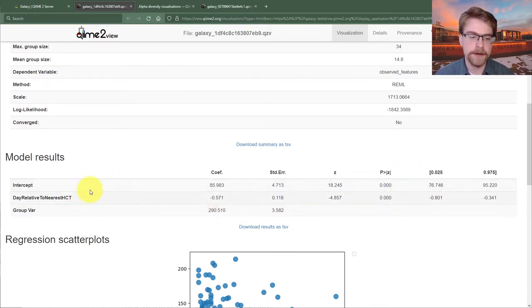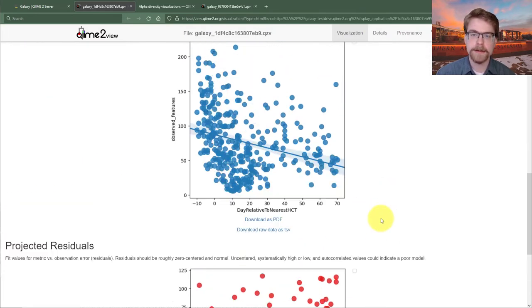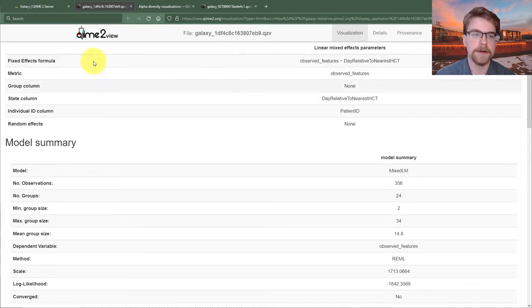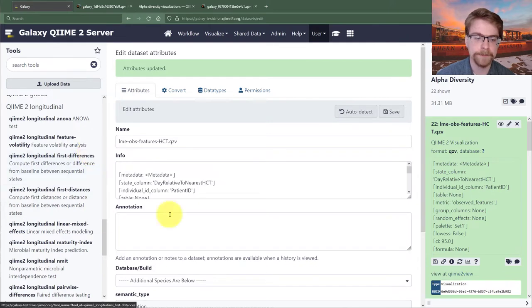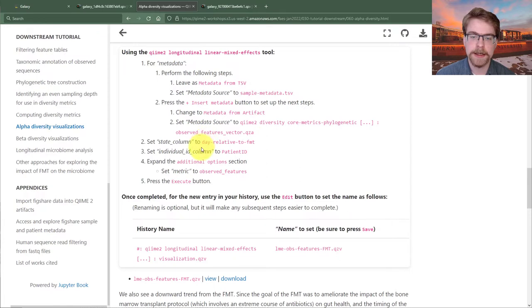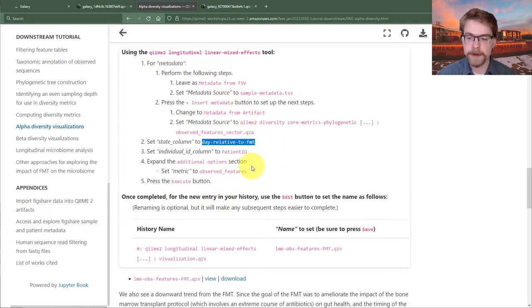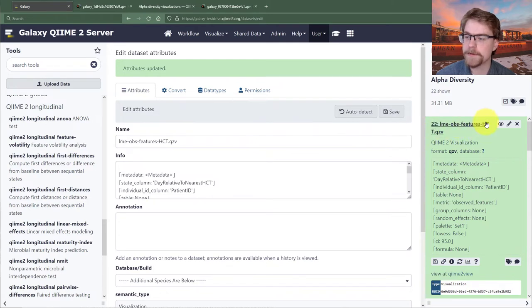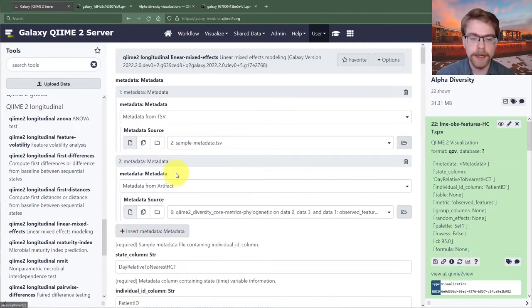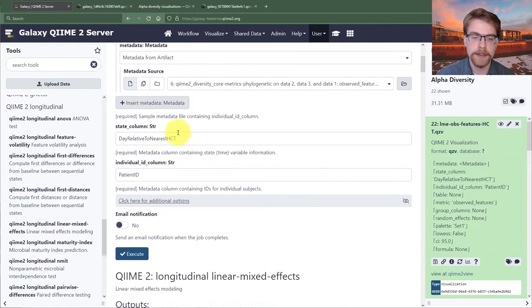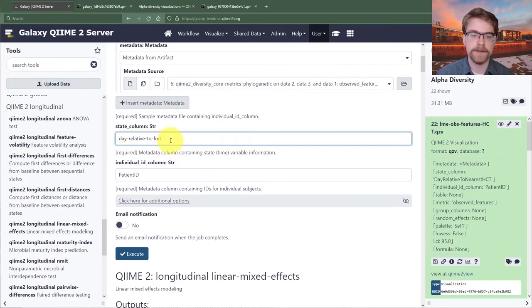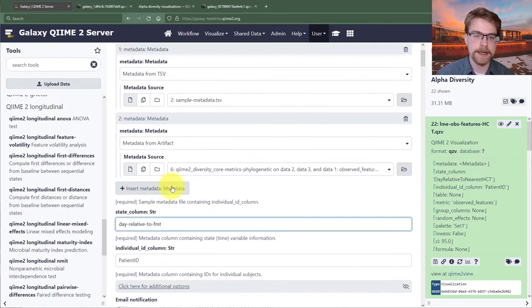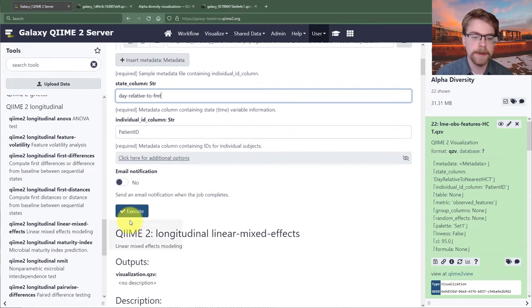We see the intercept matters, and days relative to nearest transplant matter. But we might also want to know about the fecal microbiota transplant. So the next thing to look at is day relative to FMT instead of the marrow transplant. I'll use the rerun trick — going back to the LME observed features HCT and pressing the run-again button. I'll change the state column to 'day relative to FMT', keep random intercepts on patient ID, keep the metric as observed features with sample metadata, and execute.